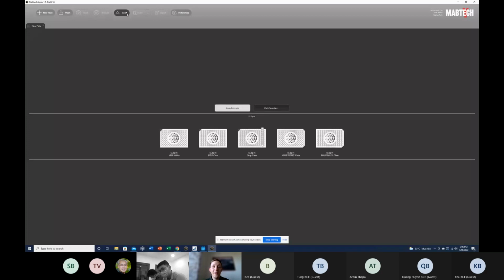When the plate holder comes out, there was a plastic string attached, I think, to secure the plate holder. Maybe it has been removed, but store that little string for later, because you might need it if you want to move this instrument between several sites.